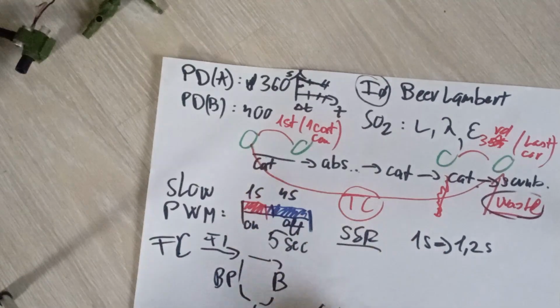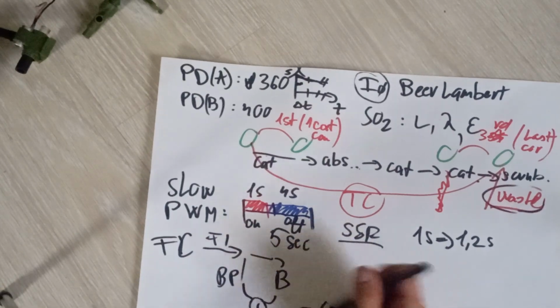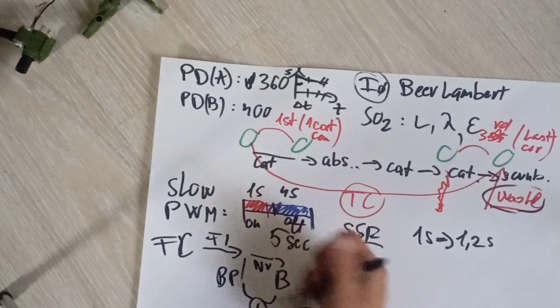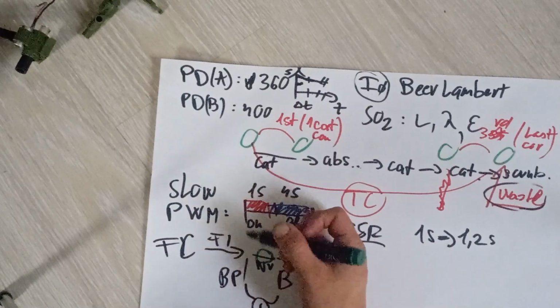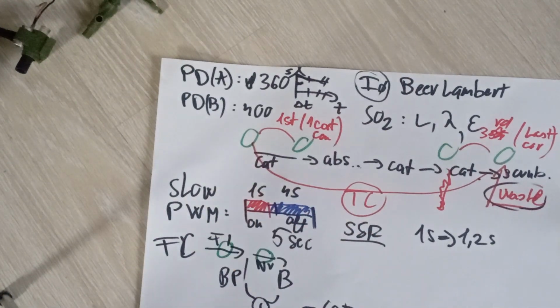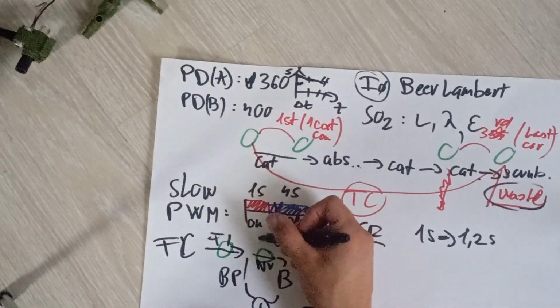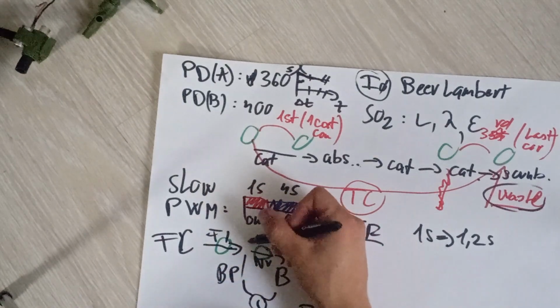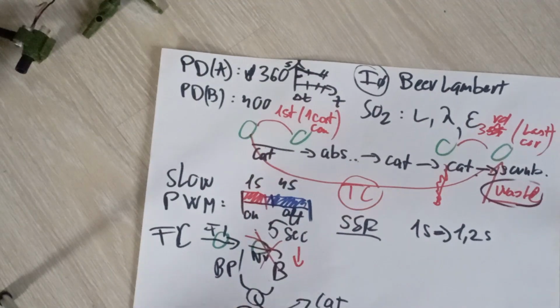Here is the dry air, here's a needle valve, and here's another needle valve. Basically we can control the incoming air as well as shut off the total burner if need be, or just maintain a lower flow. So we can totally cut it out or just decrease the amount of air coming in.